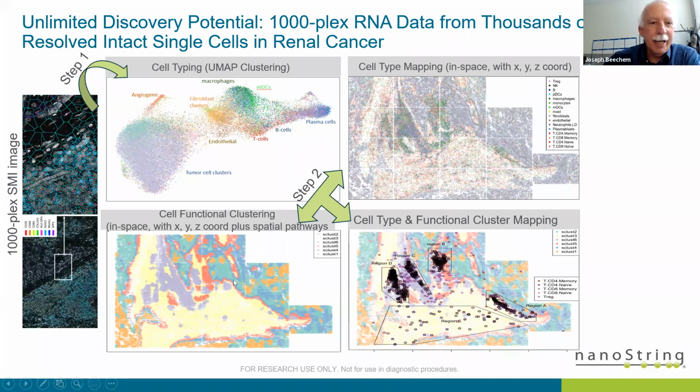And in the lower left, we're looking at gene expression in what I call neighborhoods. Are there groups of cells that tend to behave together in their gene expression pattern, and do these things spatially locate? Just like in GeoMx DSP, you find there's incredible action in changes in gene expression pattern where one tissue boundary meets another.